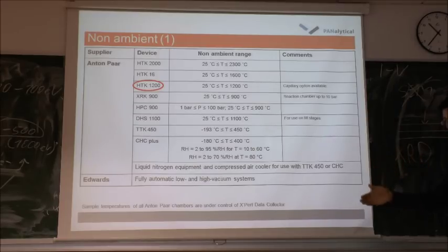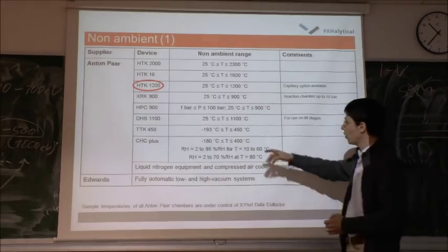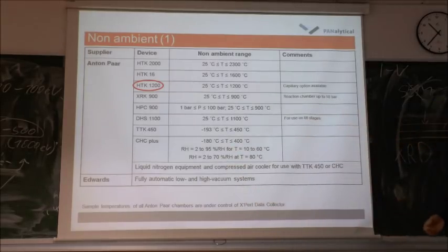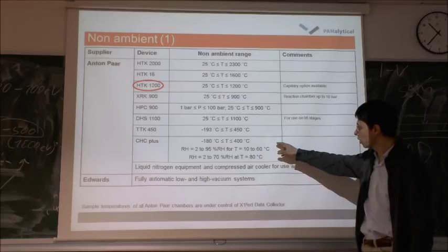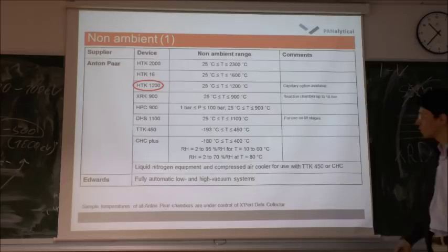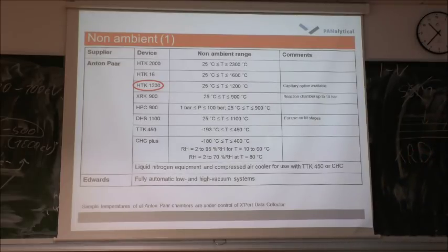for analysis of compounds like bismuth, potassium, sodium, which evaporate a lot, and then this will contaminate your environment over there. Okay, you can also decide for high pressure chambers or for chambers with high humidity. This is one chamber which was also bought at Krka in Novo Mesto. So they also bought an Empyrean, but with high humidity chambers.